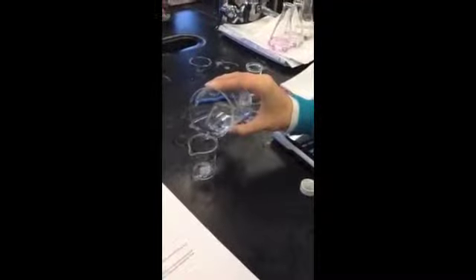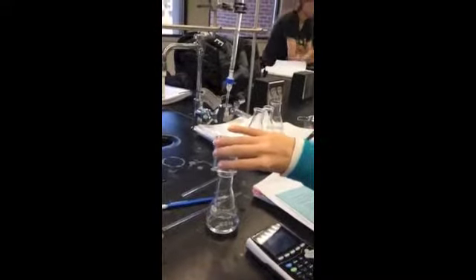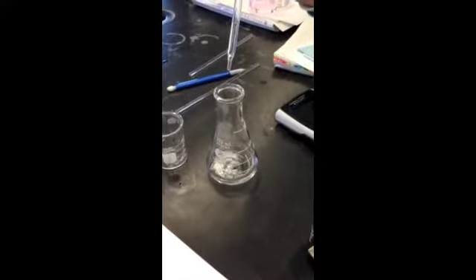Colored sodas such as Pepsi Cola or Coca-Cola cannot be analyzed by this method because their color matches the phenolphthalein endpoint. These sodas usually contain phosphoric acid. We are determining the concentration of the citric acid by placing 20 milliliters in an Erlenmeyer flask. Leigha is adding 2 drops of phenolphthalein to the citric acid. Now bring the sodium hydroxide to the endpoint.